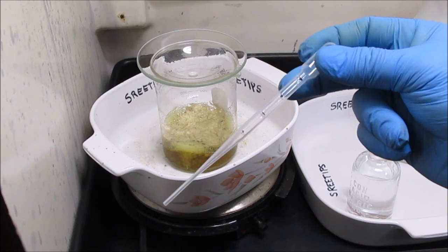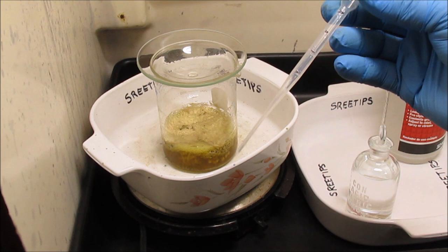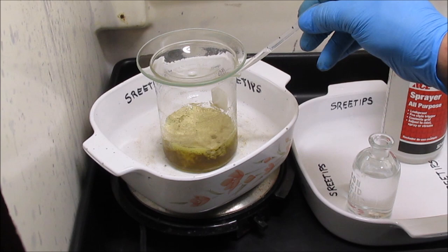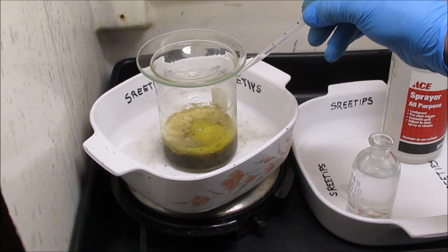What I've got here is a pipette calibrated in 1/2 mL increments. So I'm going to turn the heat down here, and I'm going to add about 1 mL of nitric acid to this. Slowly drip it in. And I think we're going to be good just dissolving the gold just like this. I don't see any need to take this back out and do any more incinerations or other treatments. I think we're going to be able to get the gold out of there just like this.